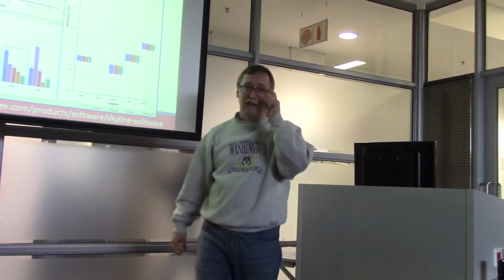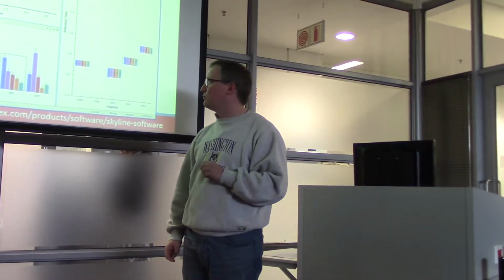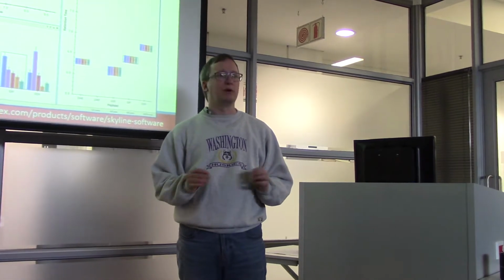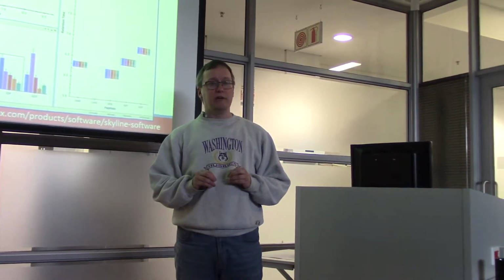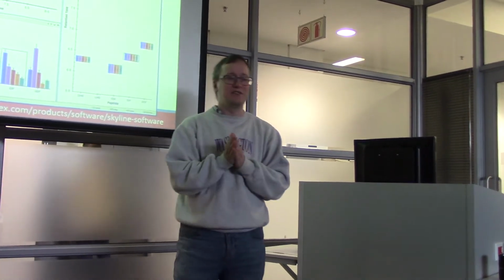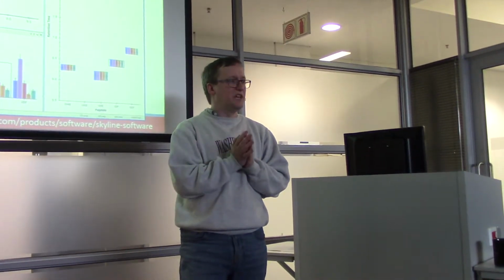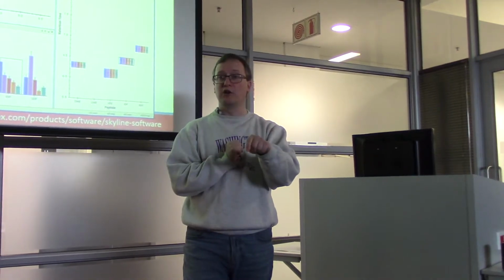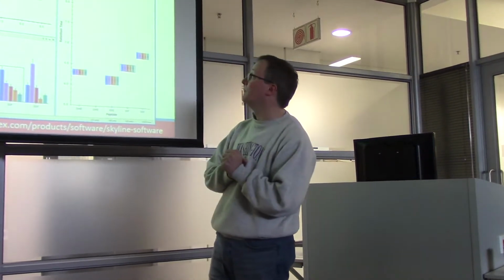Okay, Skyline is some software that I worked with long ago now. It has rapidly pushed aside lots of other software workflows that exist, and a lot of people use it now. So whether you buy your instruments from Bruker or Shimadzu or Thermo or AB SciEx, many people today will end up using Skyline to design their targeted proteomics experiment and to analyze them. It's a very widely used piece of software.